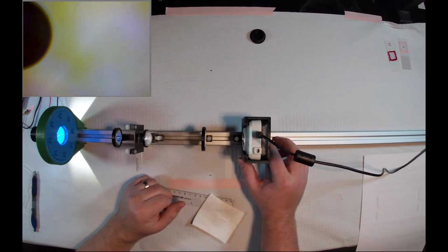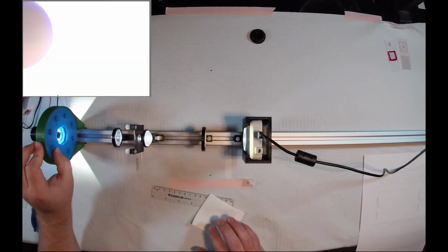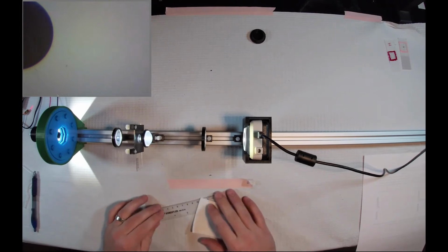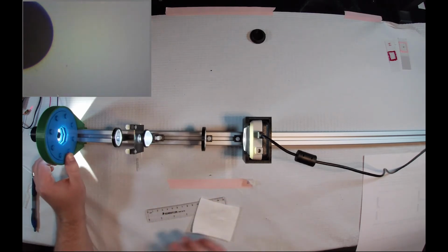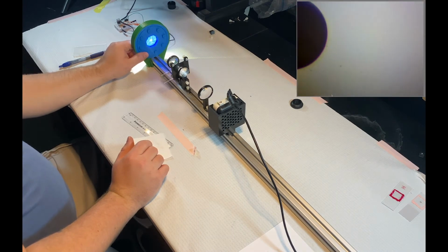So in a proper 3-lens Köhler microscope, the field stop, which is the plane that we're sort of finding, would be at the back focal plane of our collector lens. We can't quite get there, but we can get close enough.